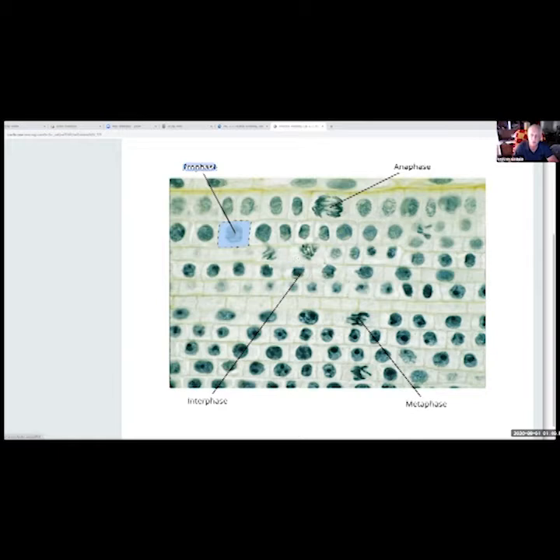And this one here is prophase also. You see where they're starting to conglomerate around. So this would be prophase, that'd be metaphase. And like I said, this would be metaphase. This is actually a good example of metaphase right there. Nice deep color. Okay, does that answer it?